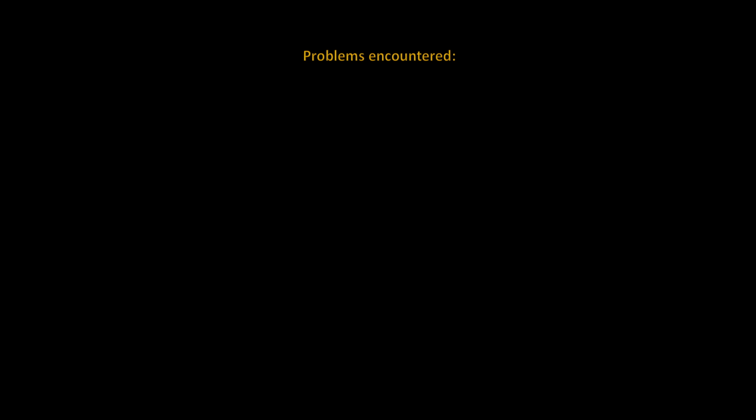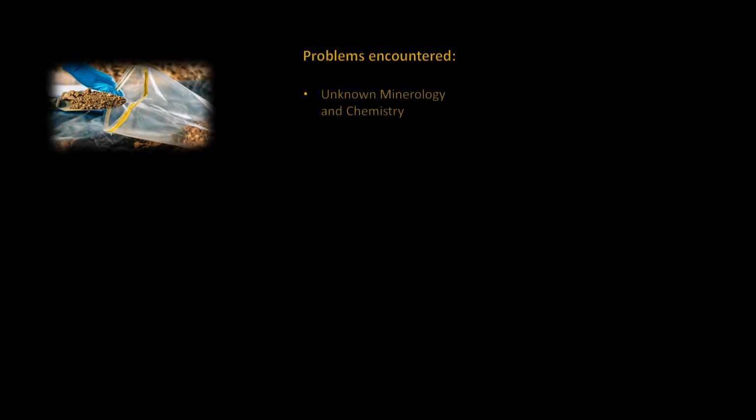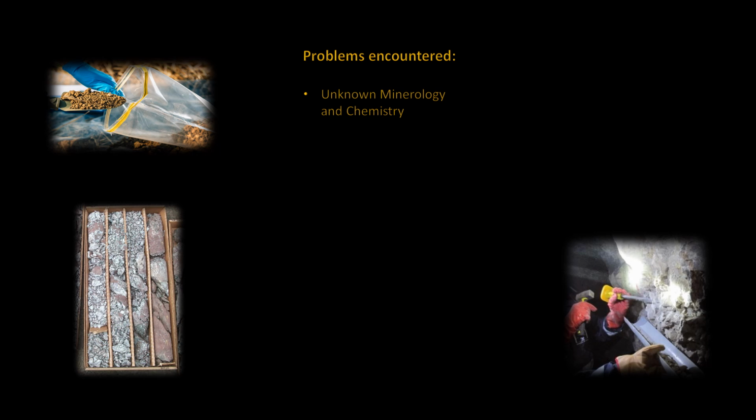Sample preparation is a big challenge. The samples collected, such as soil samples, will be of unknown chemistry or mineralogy. These may also be rock chips or core drillings. The samples that you take from the field, are they representative? There is no real way of knowing. It takes a lot of sampling to determine if they are. More important, are you going to be able to fully dissolve your samples?